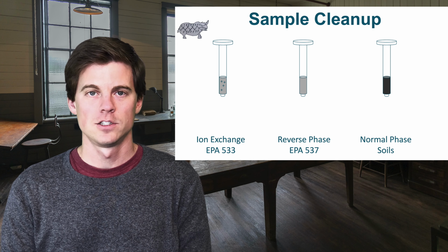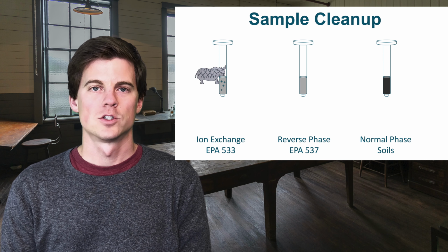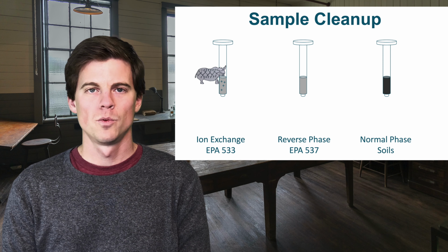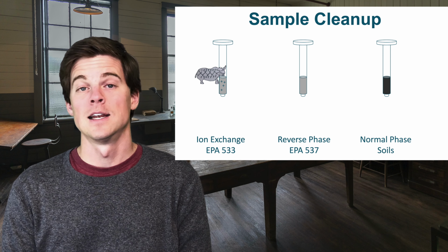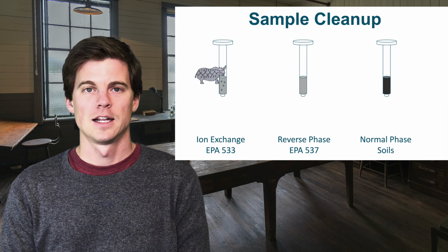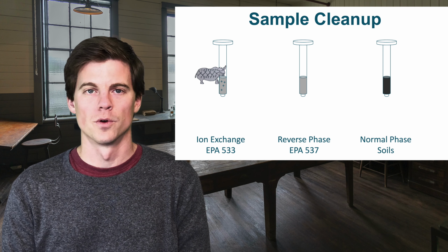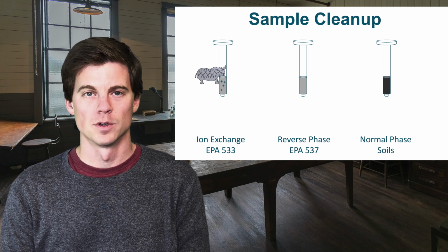It's ion exchange. With ion exchange, we're using the affinity of a sorbent in a tube, almost like a filter. This tube would have a positive charge under some conditions, which would attract the negative charge of our PFAS, and here of our PFOS. And that's a pretty strong attachment. Then you can rinse all the junk through while the PFOS or PFAS are bound to the filter.